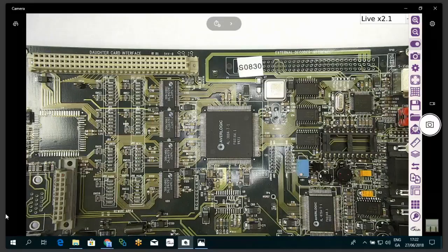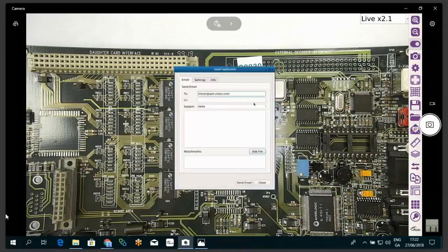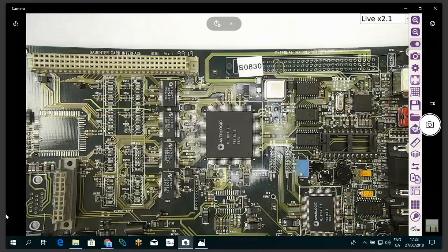So lens distortion comes with the standard model, the base model. Also, what comes with the base model is networking functions such as sending an email from a Gmail account. So you can send emails directly from the system. You just plug in your Ethernet cable, set up your account.